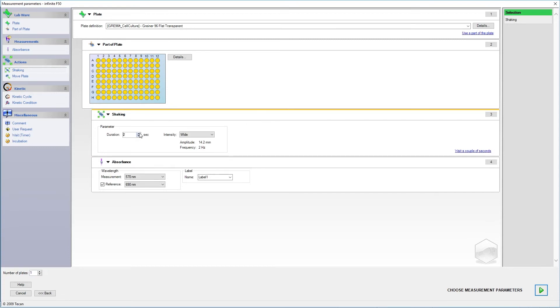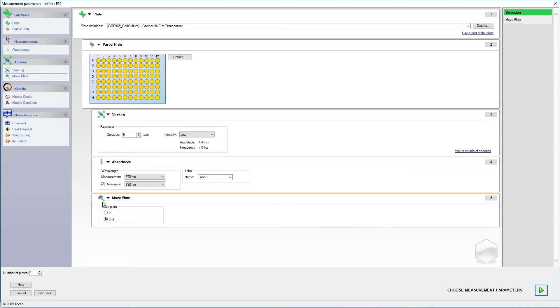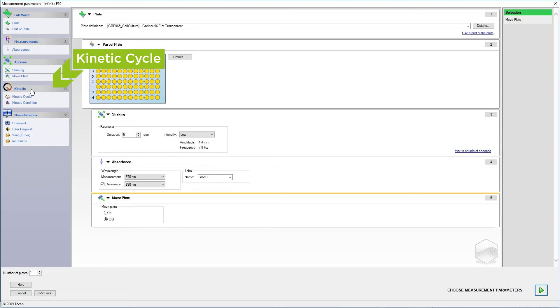For this demonstration, we want to first shake our plate, setting the desired duration and intensity. And then we can move the plate into the load position. You can also perform these actions over a time course by using the kinetic cycle parameter.